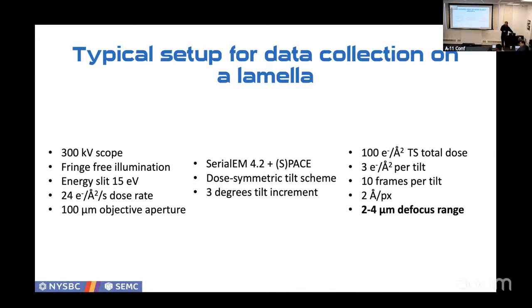Ever use a phase plate? We did in 2018. Since then, not really. We played with them, and yeah, they provide superior contrast, especially at low resolution, which was shown to be very good for tomography. If somebody has a very specific project, we'll make an exception for them, but usually we don't, and we just use defocus. However, I've heard laser phase plates are coming. That will be easy to use, so yeah, we will go back to the laser phase plate.